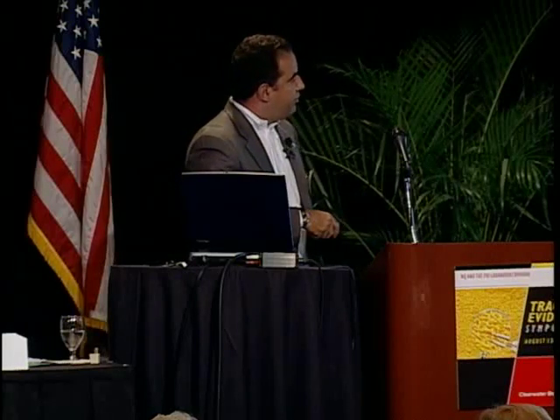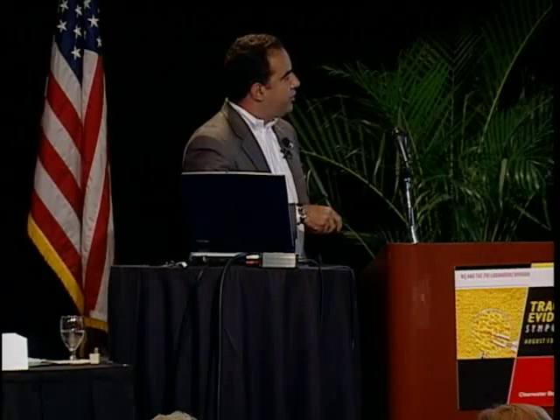This is our setup at FIU. We have the laser, and this is the optics that deliver the pulse to the sample area, and then this is the optics that actually collect the light into the spectrometer. This is a typical output of a spectra. The range here is from 220 nanometers to 950 nanometers. We have a very high resolution spectrometer, and we're using, in this case, a 1064 nanometer laser. We're only doing 10 shots.